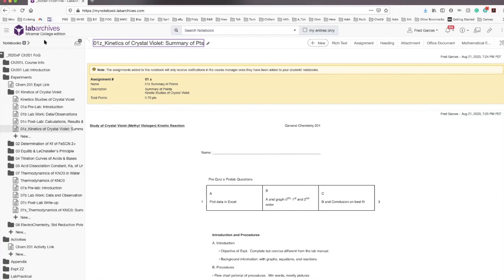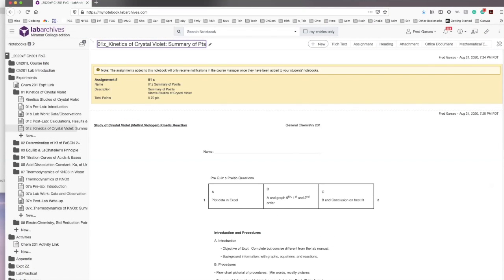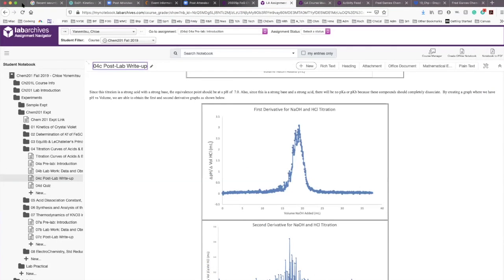If we were meeting, I would actually have you guys go in and write a pre-lab for a fictitious experiment. The other thing that you can do in LabArchives, if we were in lab, is if you have a smartphone, you can actually dictate your observation as you're doing the experiment. So it'll actually type it for you in LabArchives using the dictation function in your phone.